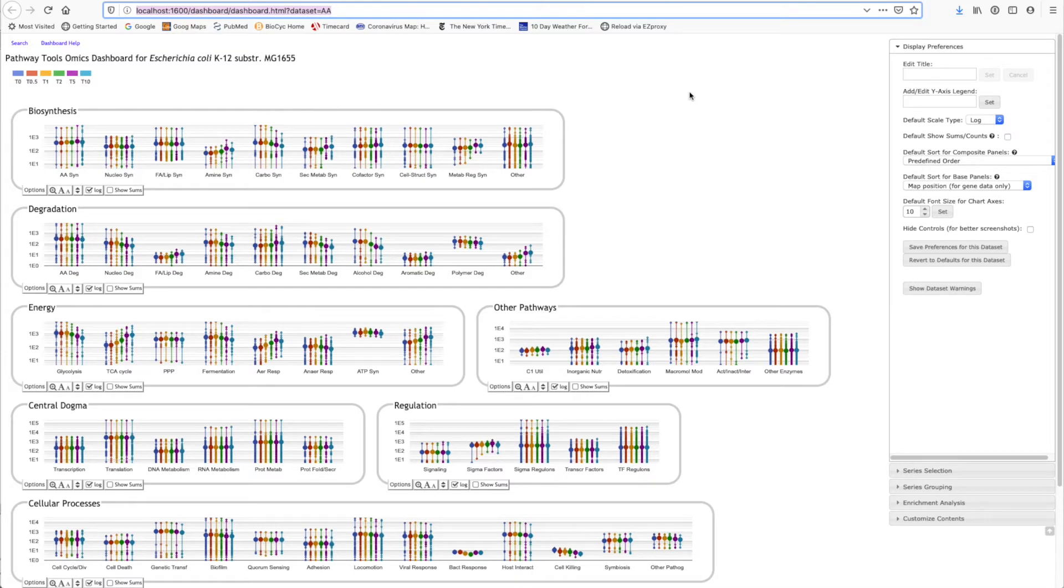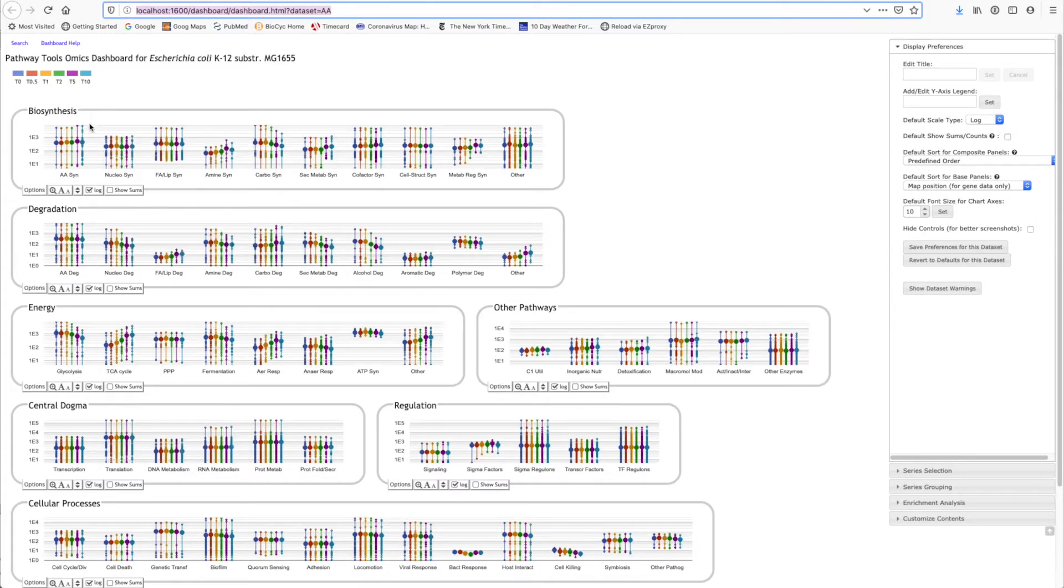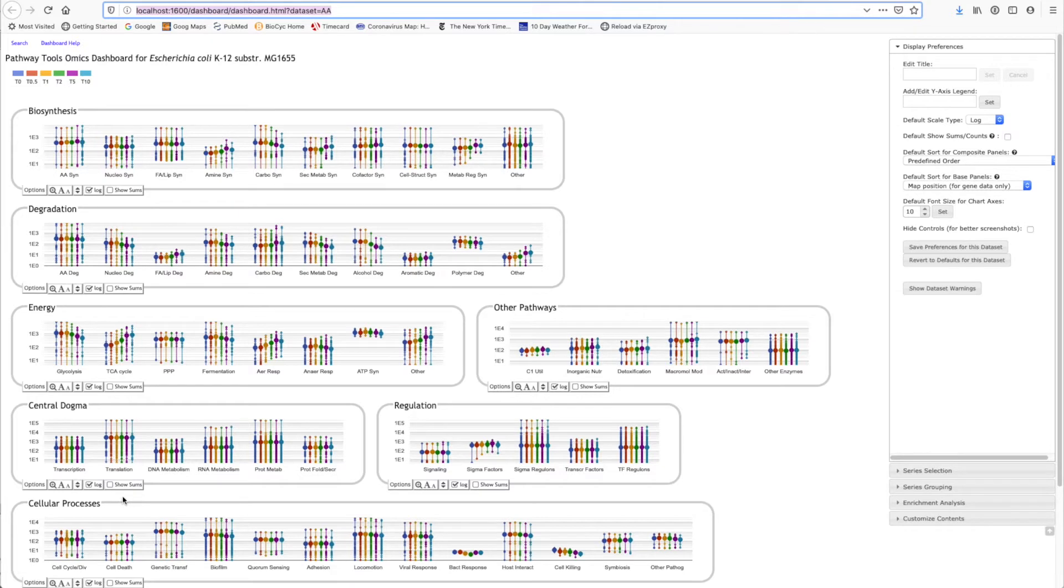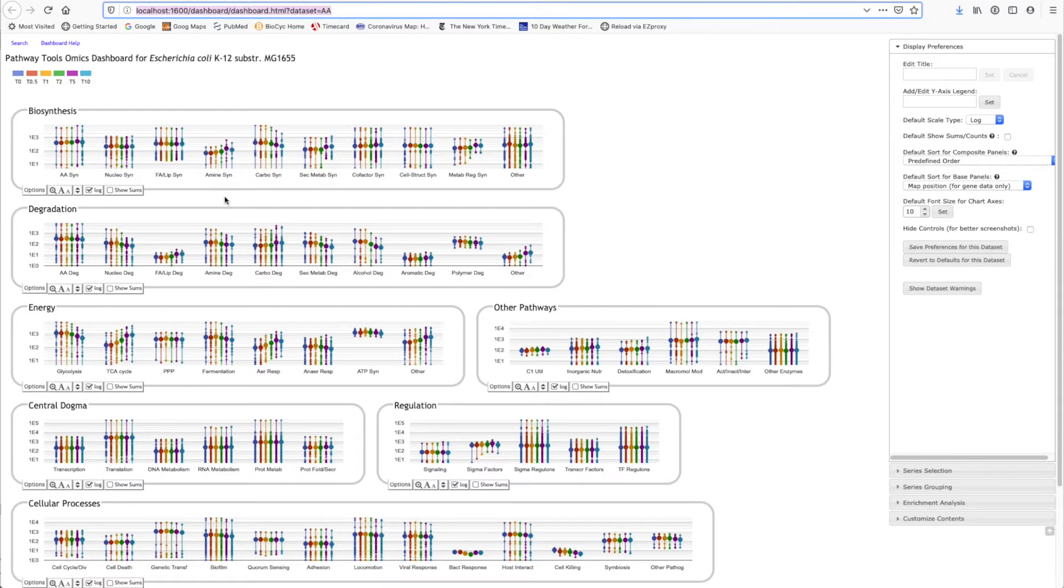The first tool we'll look at is called the omics dashboard. The dashboard is divided into several panels. There's a panel for biosynthesis, for degradation, for energy metabolism, for central dogma processes, other cellular processes, and a few other panels as well. Each panel is divided up into several plots. There's a biosynthesis plot for amino acid biosynthesis, nucleotide biosynthesis, et cetera.